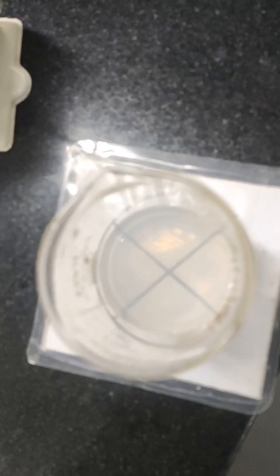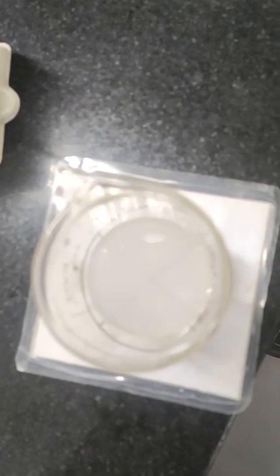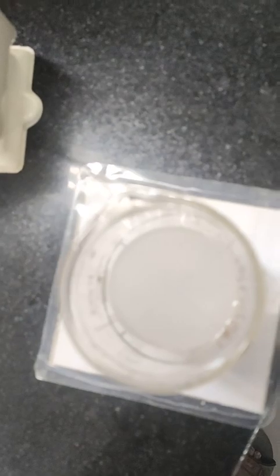The solution has started turning turbid, and the cross mark is becoming faint, and slowly it will become invisible. And you can see now it has turned invisible.